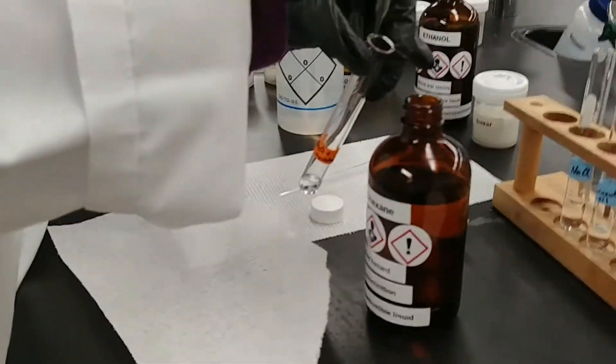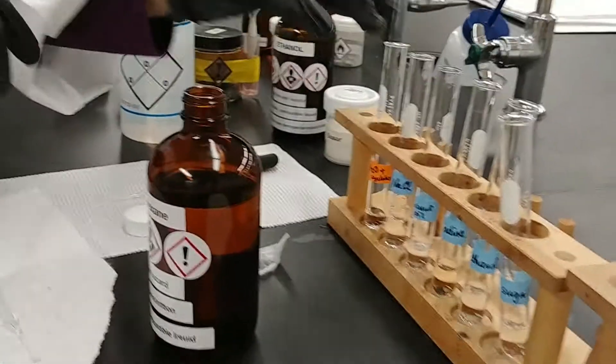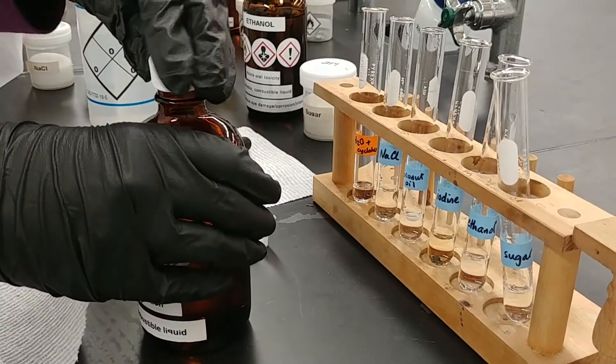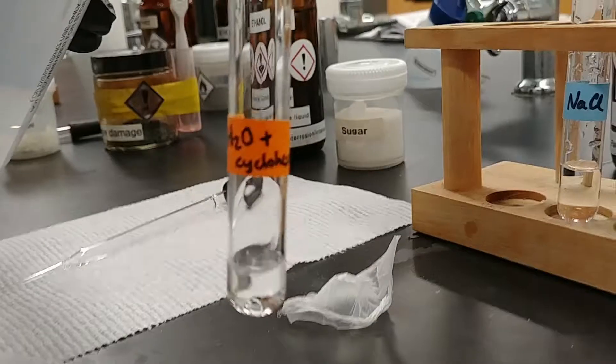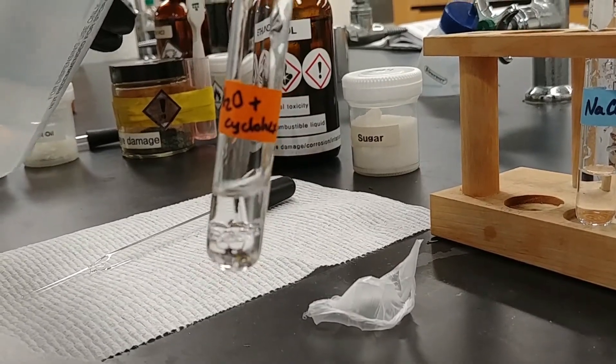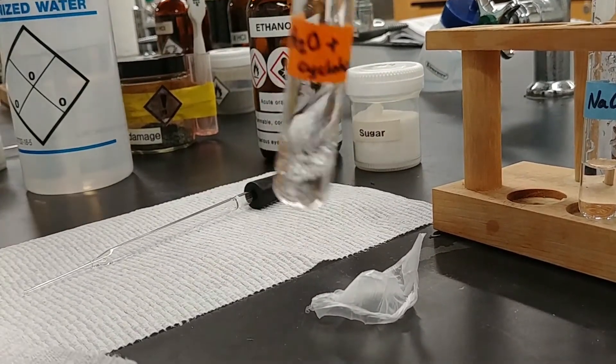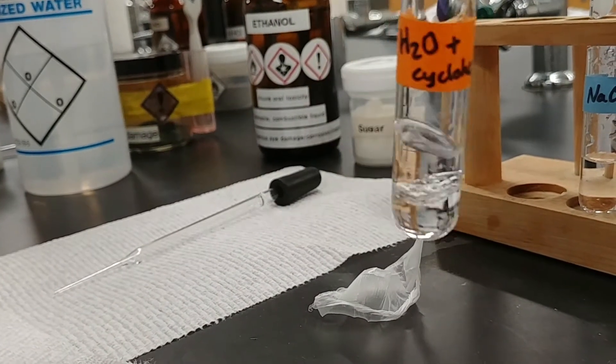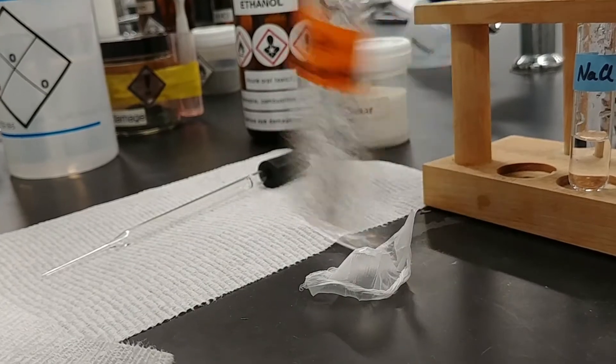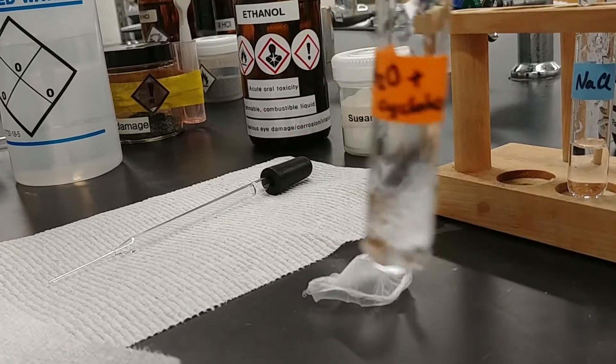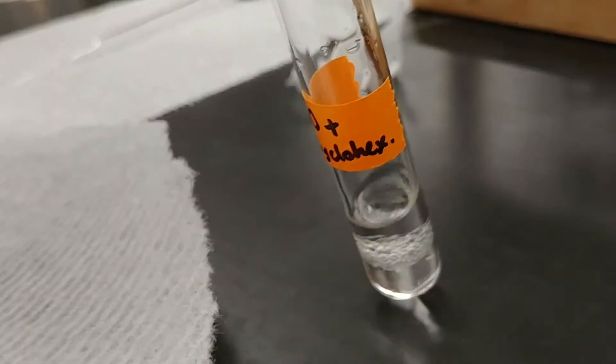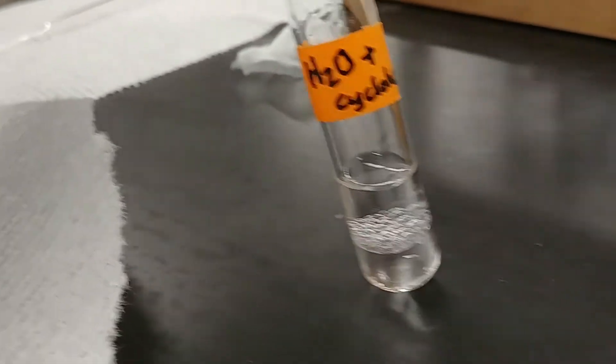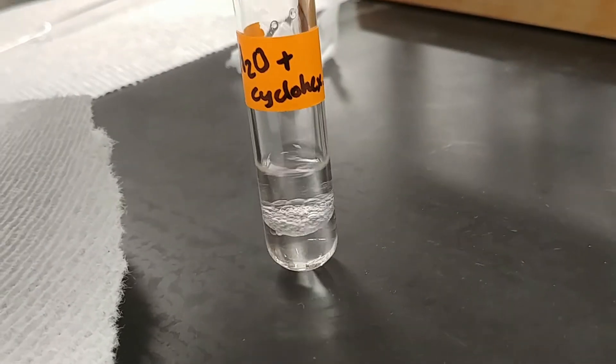So one milliliter thereabouts of the cyclohexane, and we'll add about one milliliter of water to that. So these two liquids do not like to mix. Water is polar while cyclohexane is nonpolar. So you can see that double layer there. So this is what we're looking for when we're deciding whether a liquid is immiscible.